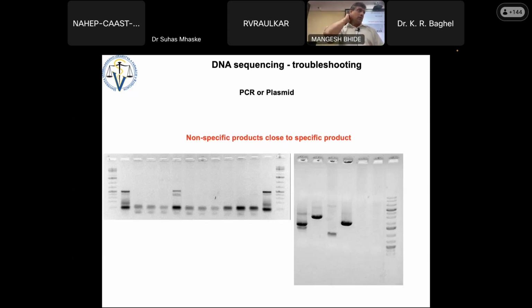Now, the answer to your question, I guess. What if there are non-specific products? Will the company be able to sequence a non-specific product, or will it fail to produce any sequence? So these are typical examples of non-specific products.